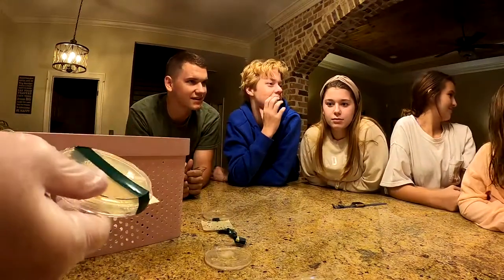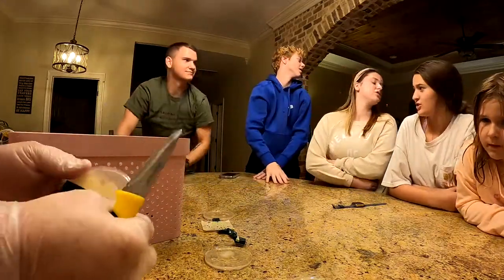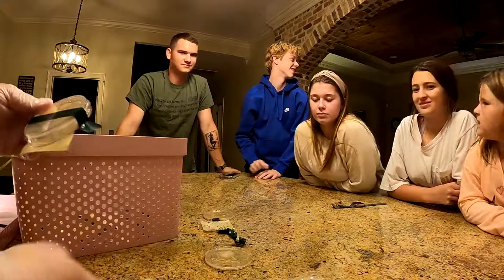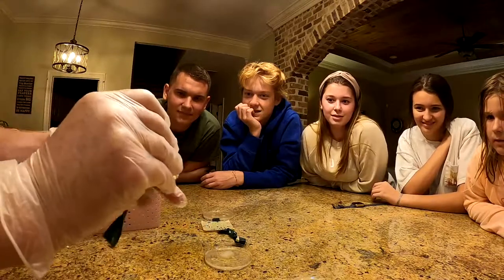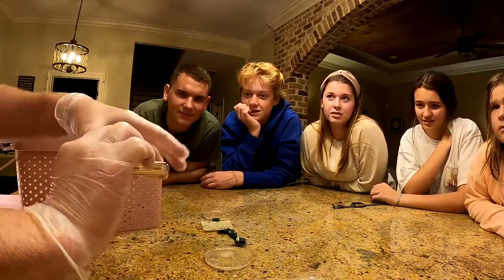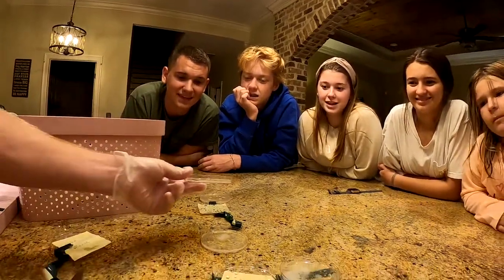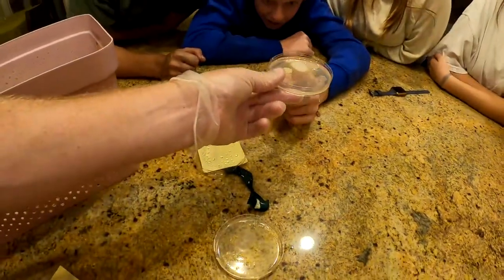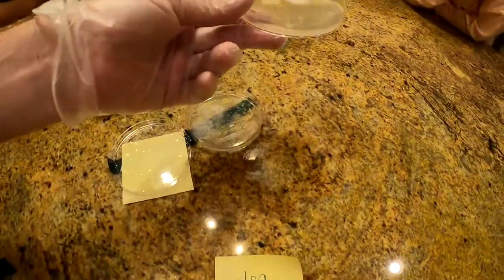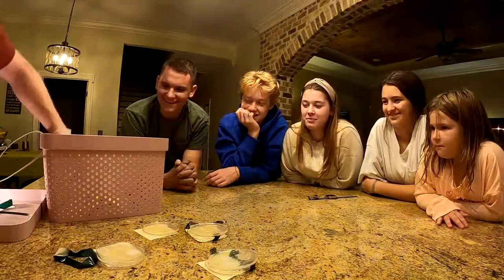The computer mouse sample comes out — it's not the most visually impressive, but it's notably thick compared to the others. The group inspects the depth of growth. Up next is Patrick's sample.